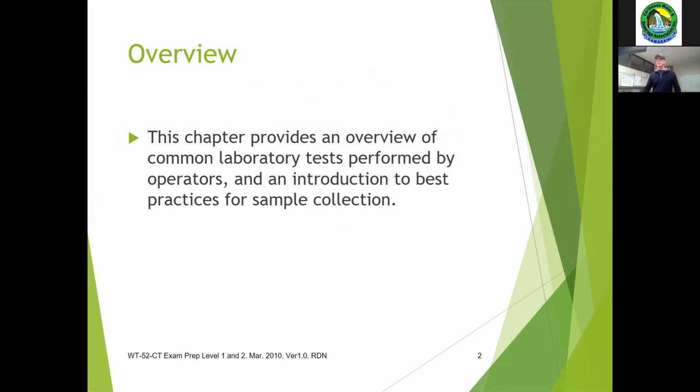This is an overview of the lab stuff, and not every place does this kind of testing. Some places do very minimal testing by the operations staff, and some places have specialized laboratory staff that will come in and do a lot of these tests. Some of the tests we'll talk about, we send away to get processed by an accredited lab. What we will do here at our plant, of course, is our chlorine residual, and we'll do our basic chemistry lab, which is your conductivity, alkalinity, hardness.